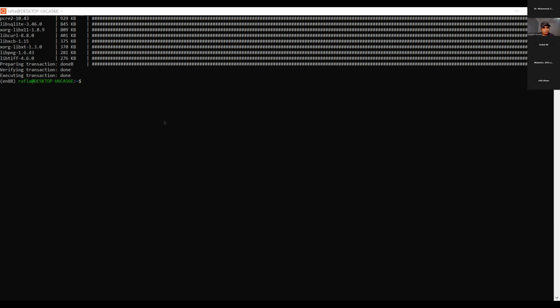Sir, can you please tell us how we can download the RNA-seq file from NCBI? Okay, FASTQ.